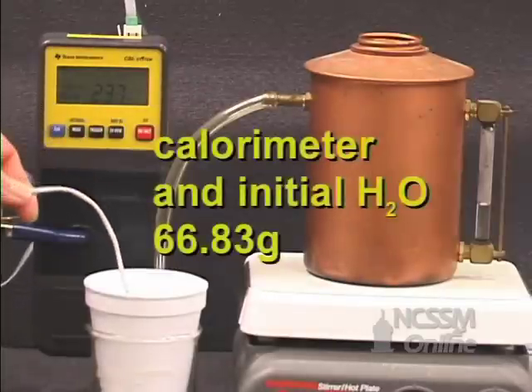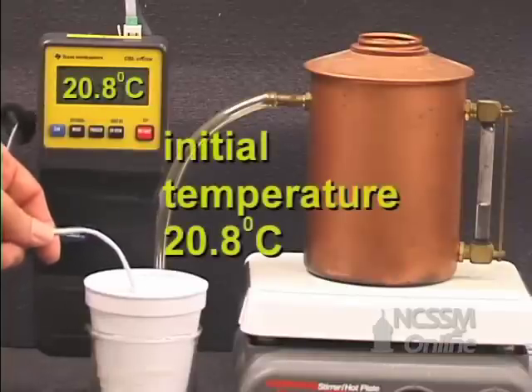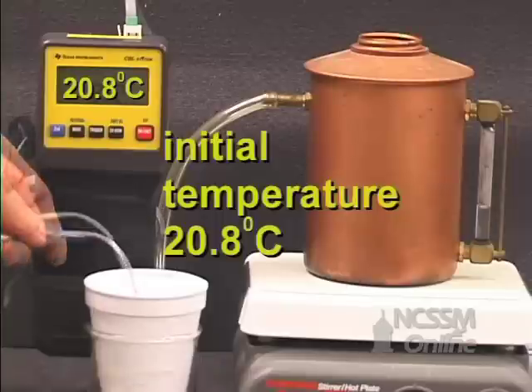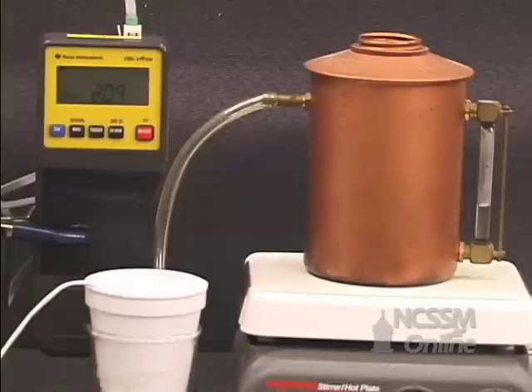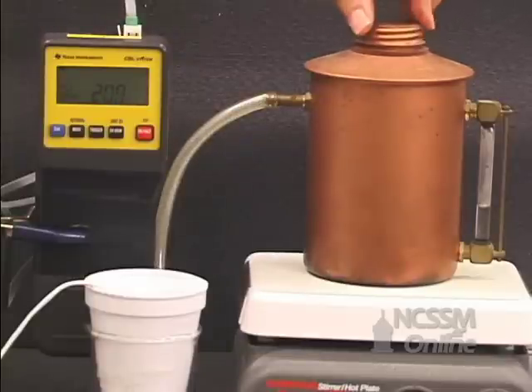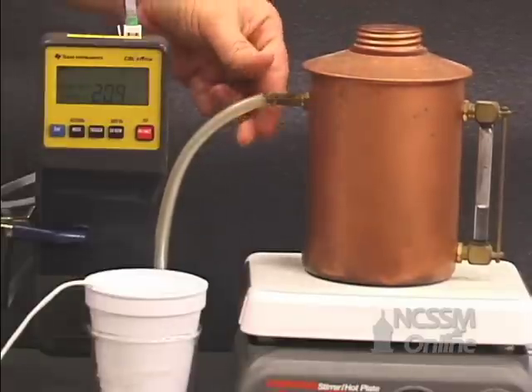We're going to use our CBL and temperature probe to measure the initial temperature of the water. We have a steam generator containing water. I'm going to cap off the steam generator, and we're going to bubble steam through our calorimeter.